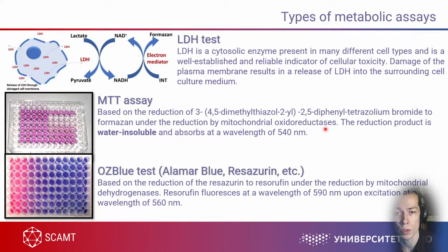So it's a good choice for very fast screening of cytotoxicity of your nanoparticles. There are also some other examples of metabolic assays. For example, the LDH assay. The LDH assay works on a different principle, but a very similar one, because again, formazan and so on.